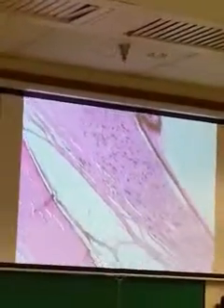All right. So now you notice we're here at the lens. Once we go posterior to the lens, this is now the posterior cavity. Anterior cavity is anterior to the lens all the way up to the cornea, between the cornea and the lens. Posterior to the lens, this is all posterior cavity. Oh, there we go. Look at that. Big posterior cavity.